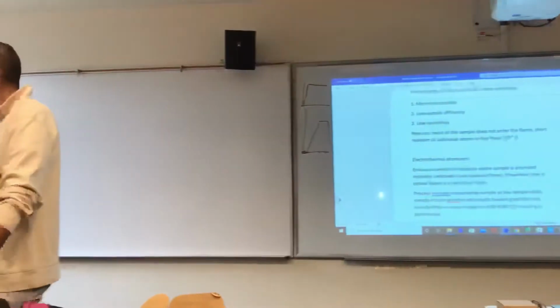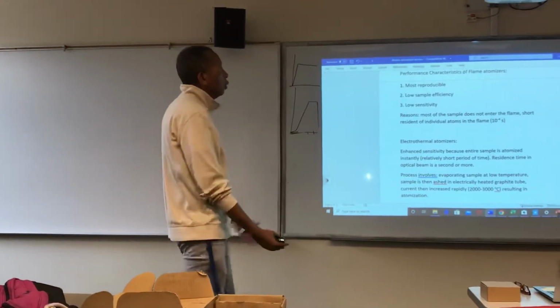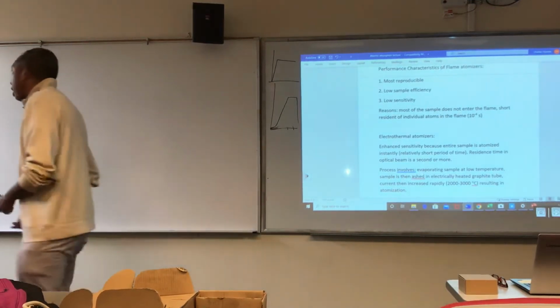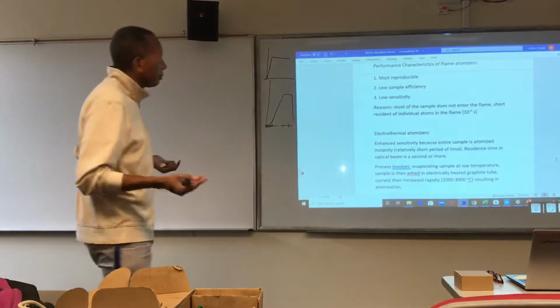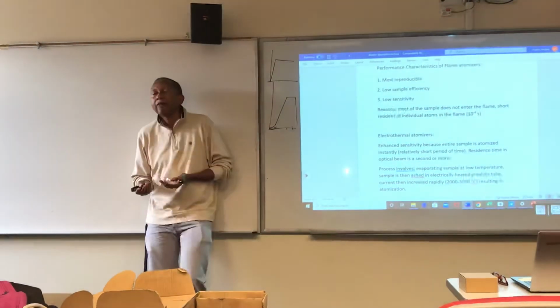And so performance characteristics that we looked at before is just what are the criteria that we would use to evaluate a technique, right? So the example that should come to your mind when you talk about performance characteristics is always your cell phone, right? You use performance characteristics when you want to buy a cell phone, right?